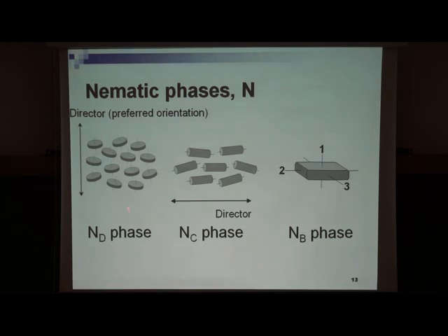And in these phases, as you can see from this picture, micelles are oriented in this direction. This is called the phase director. And in the NC phase, the phase director is in this way.